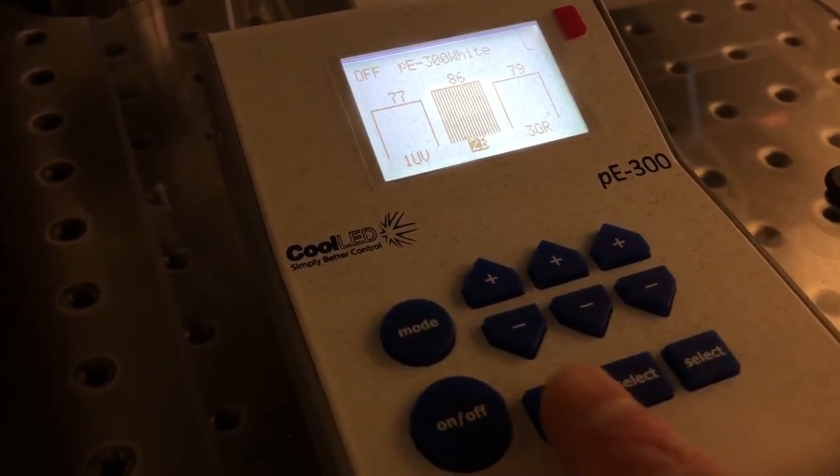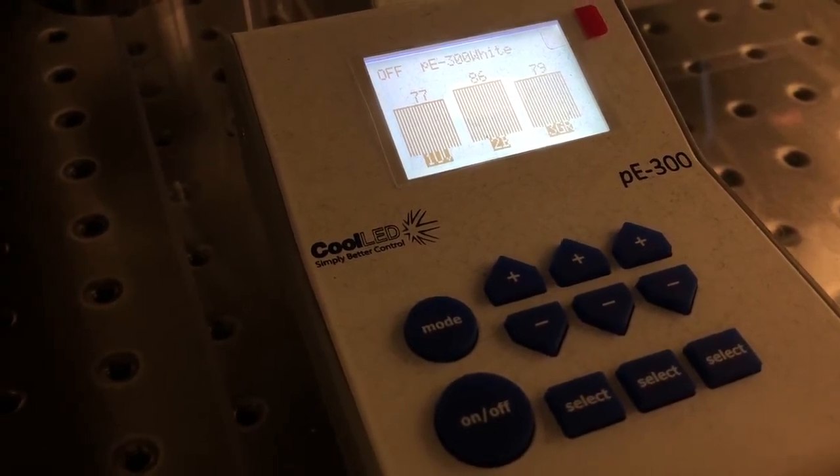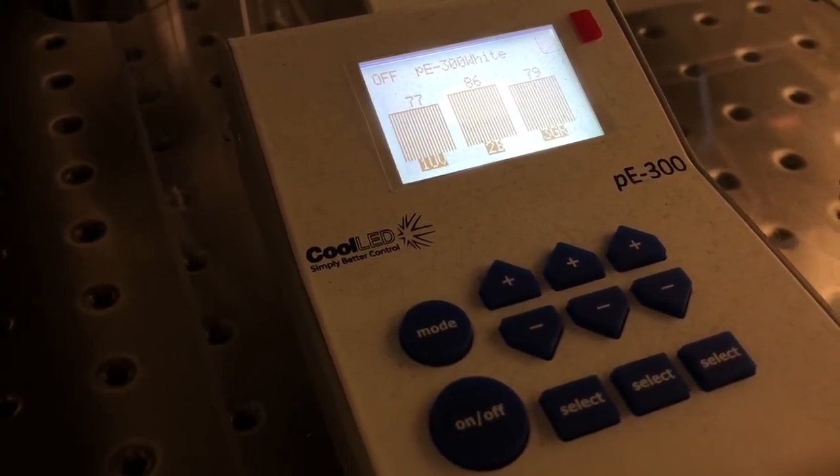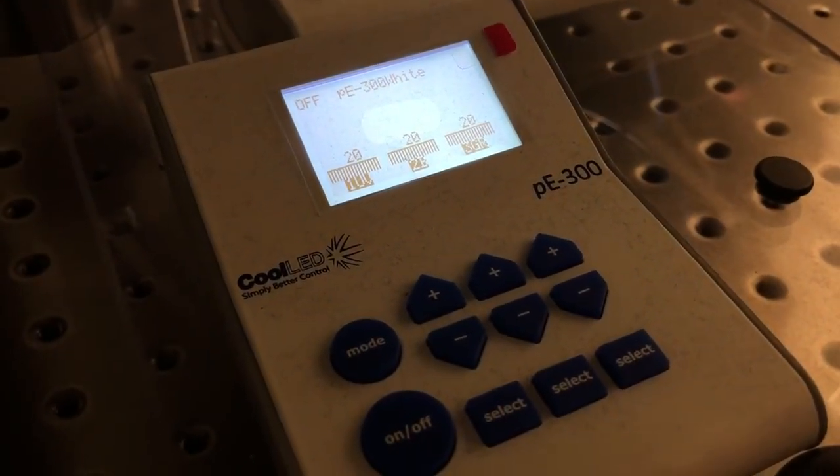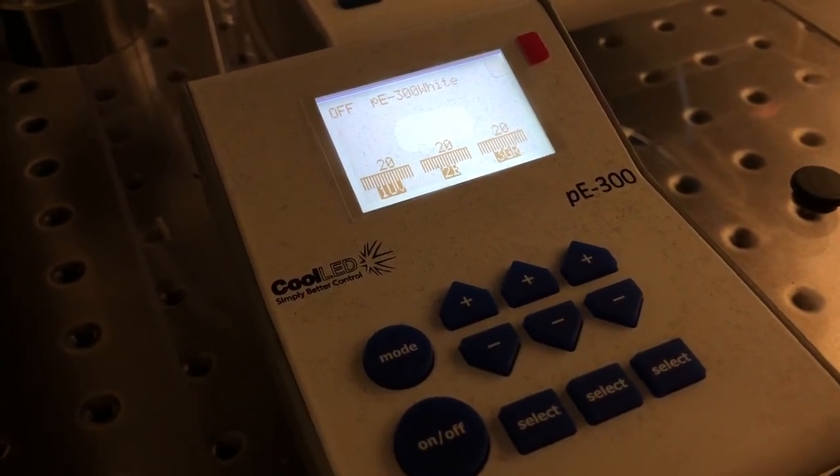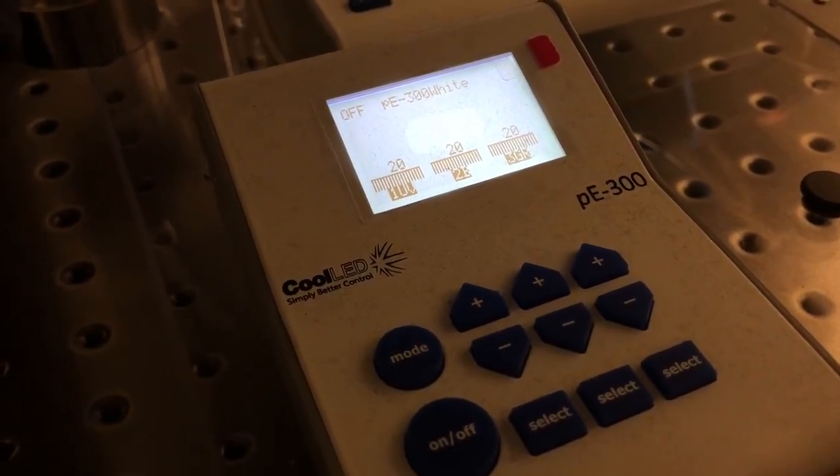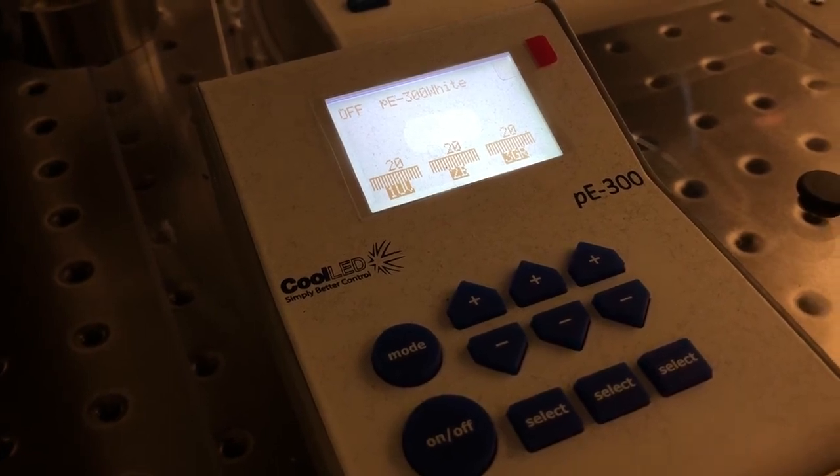By default, this will always be set to all three on and the intensity will be set to 20%. This will usually be sufficient for most typical samples, and be aware that if you look at them by eye using this illuminator, this may cause a significant amount of bleaching, so be very careful when you do this.